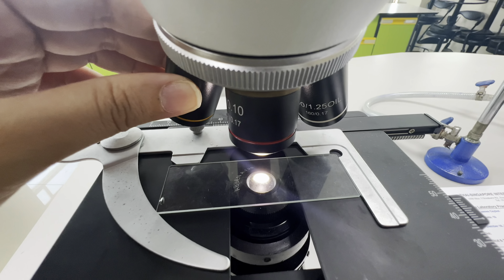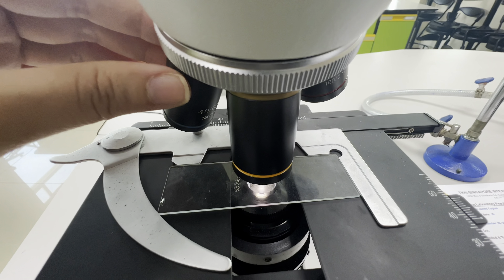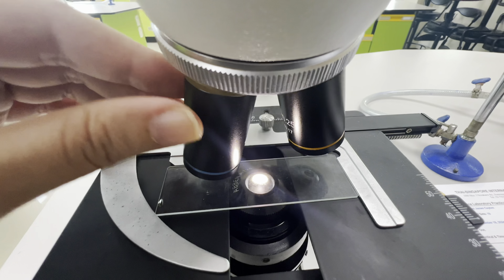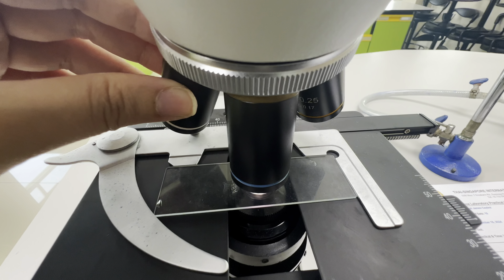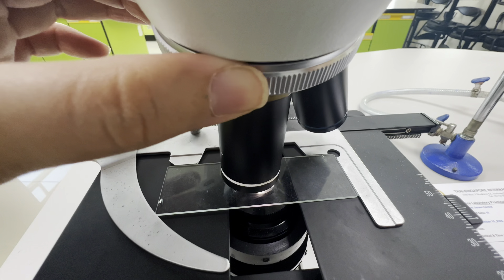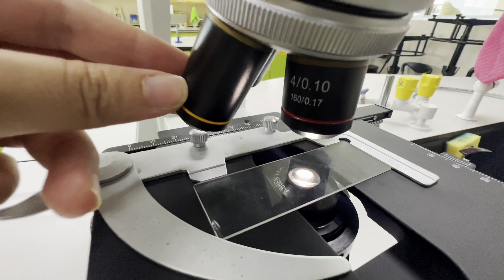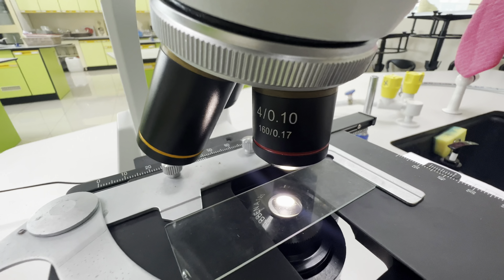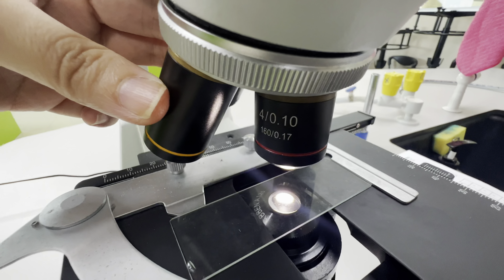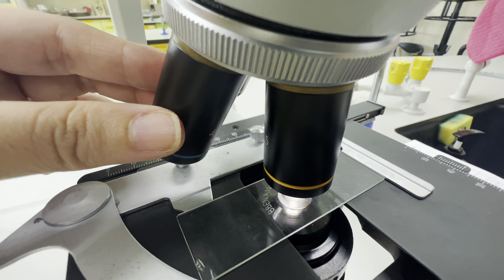These are the objective lenses, attached to the revolving nosepiece. The nosepiece is a part that holds two or more objective lenses and can be rotated to easily change power. These microscopes have four objectives. The red is a scanner with 4 times magnification.